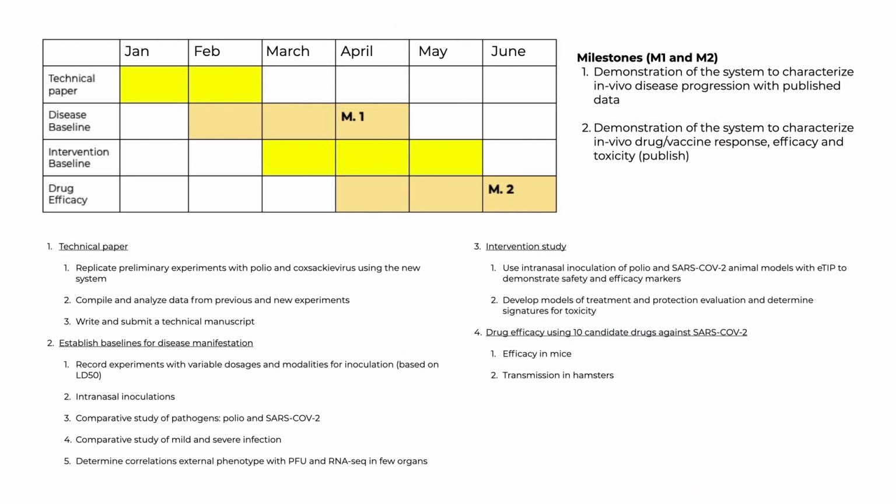In the next 6 months, we plan to: A. Complete ongoing experiments and publish findings with our research collaborators. B. Develop several more cages based on demand from partner labs and test new sensors for specialized experiments. C. Ultimately, we plan to demonstrate how this type of data can be utilized for basic research, drug testing, as well as characterization of treatment response to optimize and shorten preclinical testing.